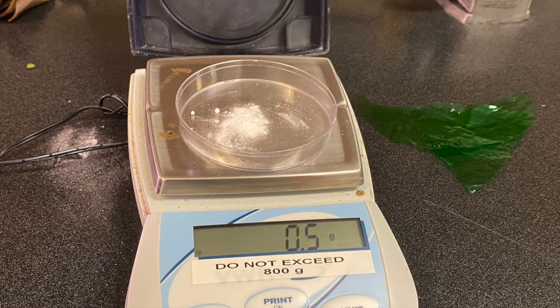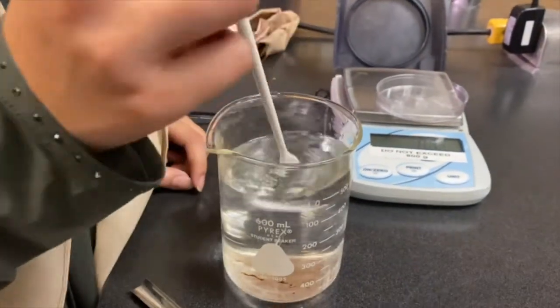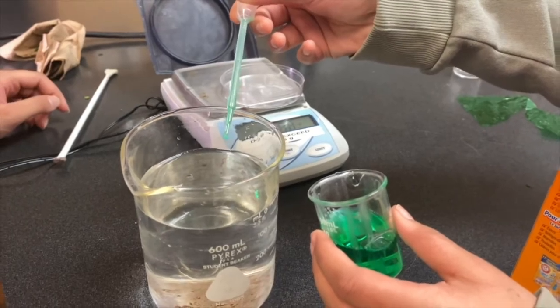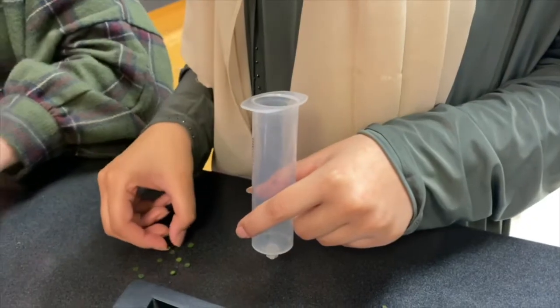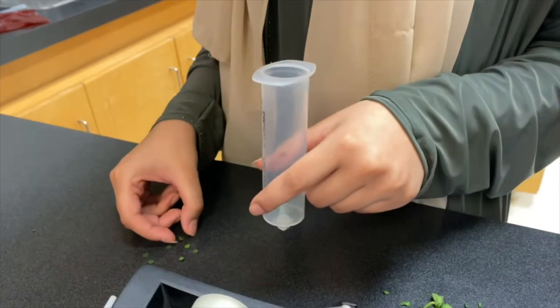The procedure is: first, mix 0.5 grams of baking soda with 500 milliliters of water to create a bicarbonate solution. Add 5 drops of liquid dish soap to the solution and mix. With the straw, cut out 10 circles or discs from the spinach leaves. Take the syringe, remove its plunger, and also remove the cover from the tip, if there is one.